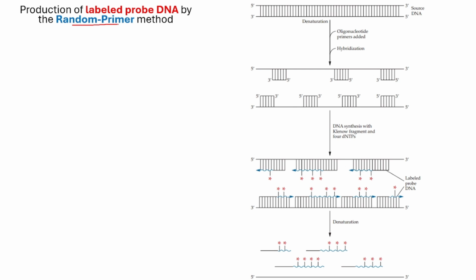The purpose of this preparation is that the probe you prepare will be useful for identifying and locating any particular DNA sequence against which this probe DNA is made. That we will discuss in a separate lecture. But any application of a probe is to find out its target DNA. For that, you need to make the probe first, and then you need to label the probe, be it fluorescence labeling or radioactive labeling, because when you let the probe hybridize with its target DNA, you won't be able to figure it out if you don't label it.